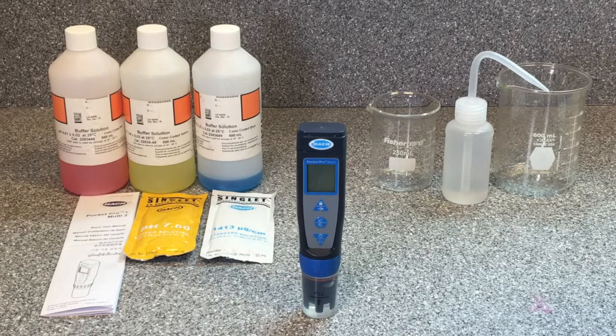The Pocket Pro needs to be calibrated to make sure we are getting accurate water quality results. The two parameters that need to be calibrated are pH and conductivity. Conductivity needs to be calibrated before initial use and then usually does not require calibration again after that. Because of the way pH is measured, it needs the initial calibration but will also require ongoing calibrations to maintain accuracy. We'll demonstrate both the initial calibration for conductivity and pH, and then the ongoing calibrations for pH.